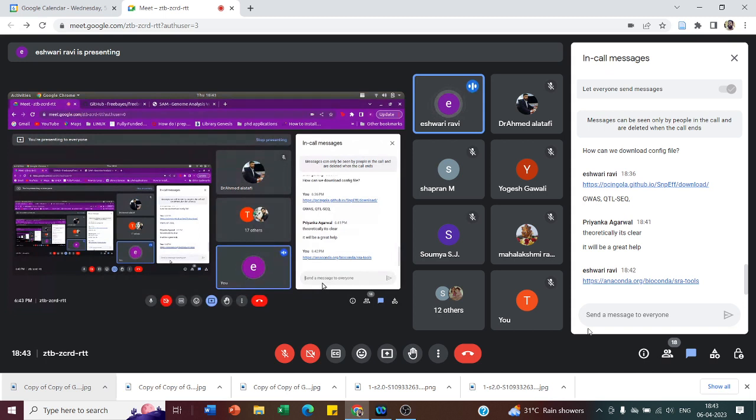The reason why I'm not showing it is because I don't want you all to confuse Linux based tools with Galaxy. But you can also open Galaxy, explore it, submit your files there, and it will always specify what is the expected input file and what will be the outcome there. And you can interpret based on your choice of study.